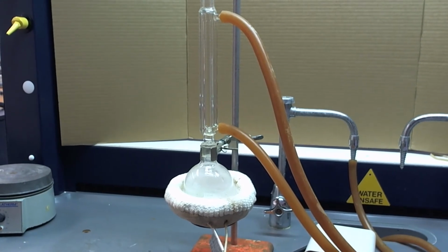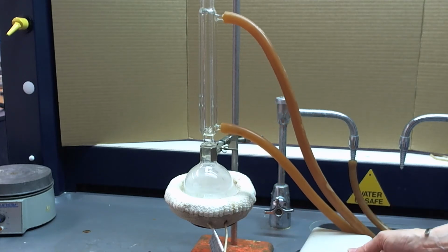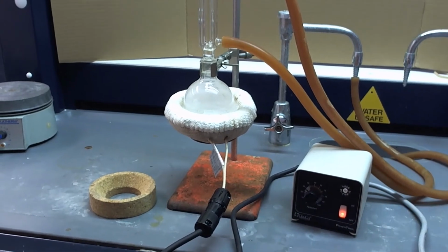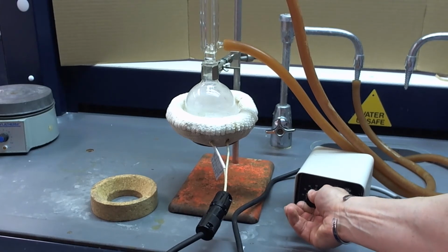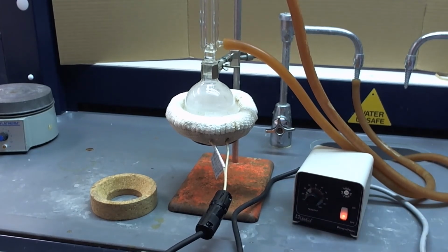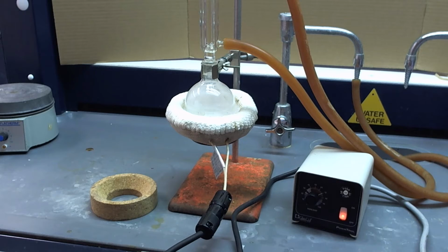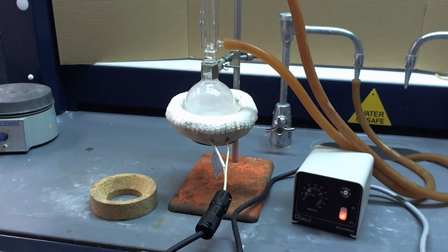Okay. All right. Now, let's turn on the temperature controller. Okay, so I just turn this little switch. And now we need to choose an appropriate setting for the dial. You'll get a feel for this over time. But if water is your solvent, which it was for me, I can turn that to maybe the 7 or 70% point. Okay. If it's an organic solvent with a lower boiling point, you want to be more conservative, between the 30 or the 50%, the 3 or the 5 setting.